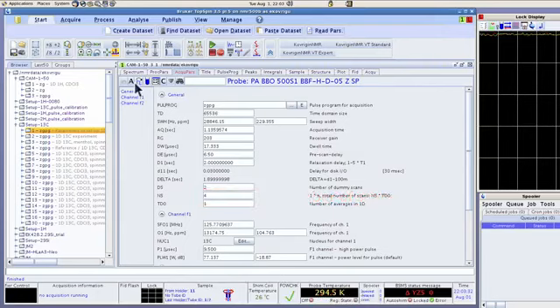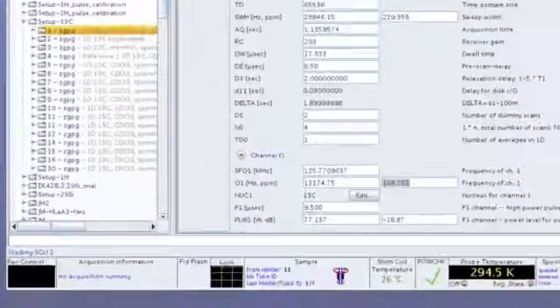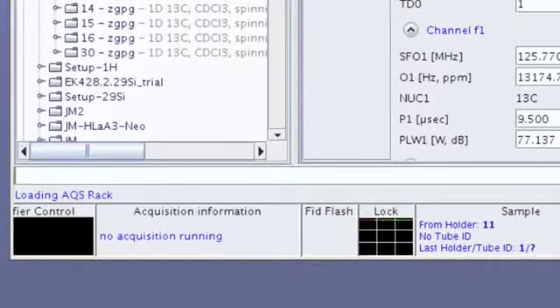Removal from the magnet: 1. Use the MA lift to slowly and steadily raise the probe. 2. Once clear of the bore, secure it on its stand or a stable surface. Cable management: never let the probe dangle by its cables. Coil cables neatly, without putting stress on the connectors.